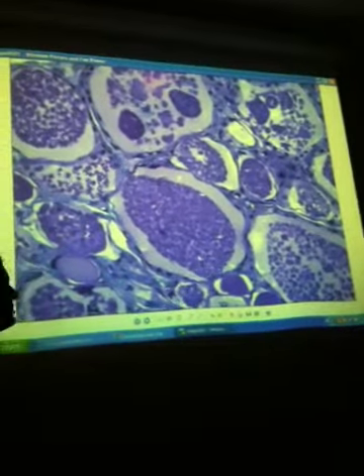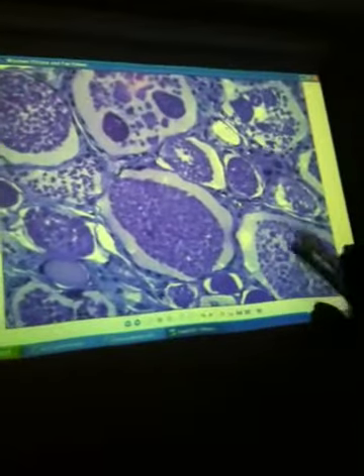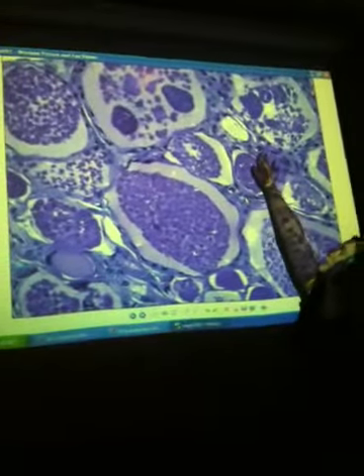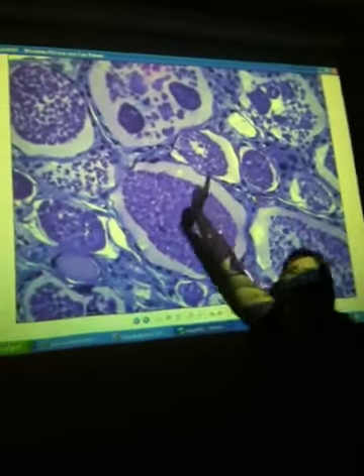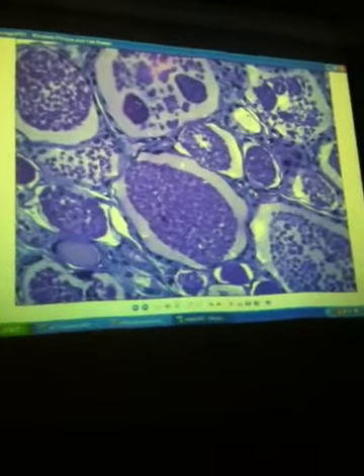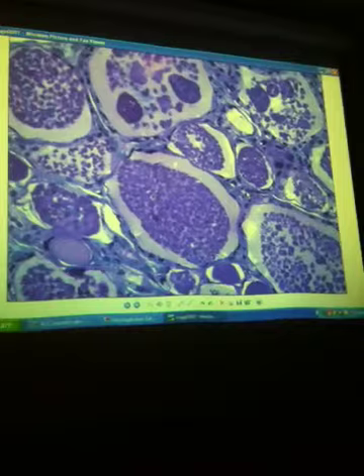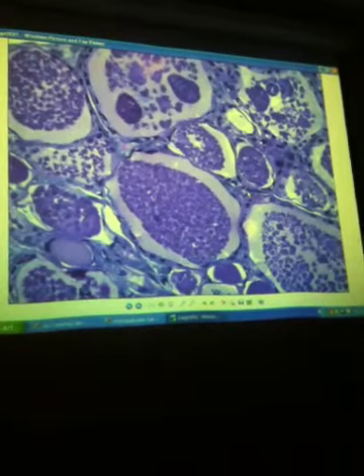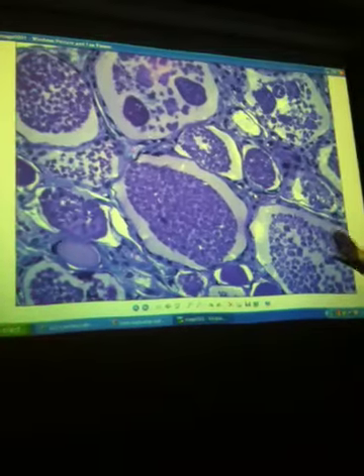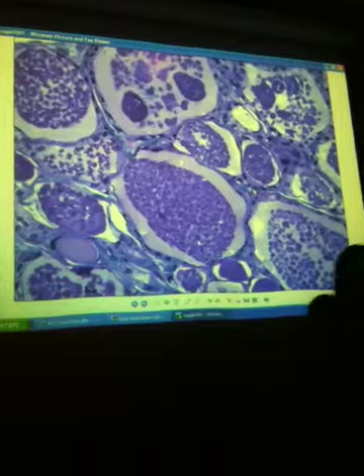And then they want you to be able to find parafollicular cells, which are usually bigger, and they exist between the cells. Like here's a parafollicular cell, way up there is one, and there is a grouping of them up there. So make it simpler for yourself. If it forms the ring, it's a follicular cell. If it's another cell, it's parafollicular. If it's inside the circle, it's colloid. So inside the big circle, this is all colloid in here. If I ask you what the whole structure name is, that's a follicle.